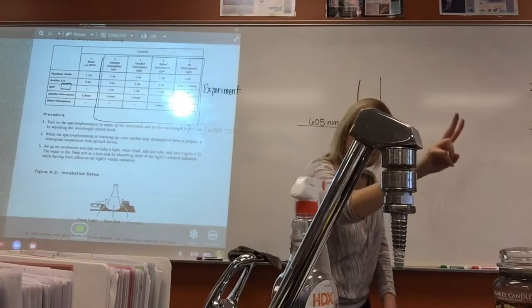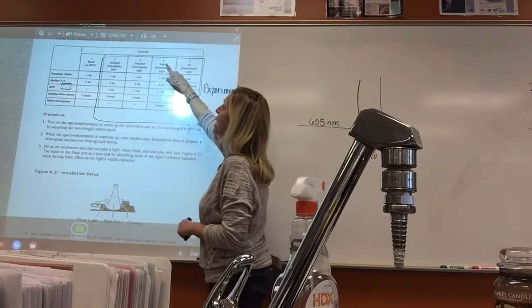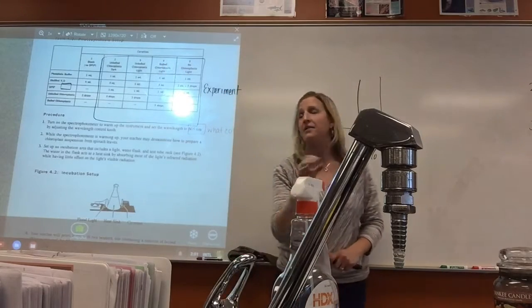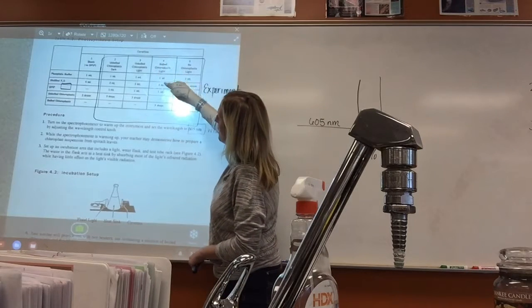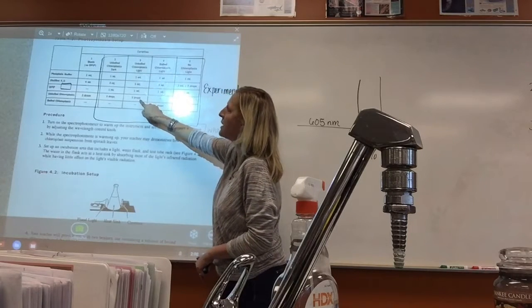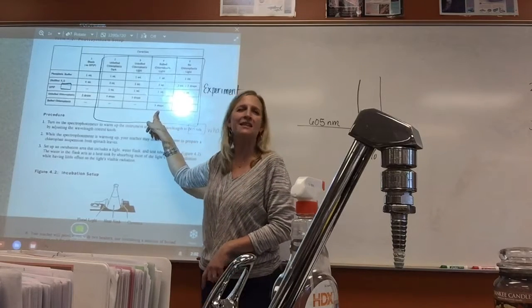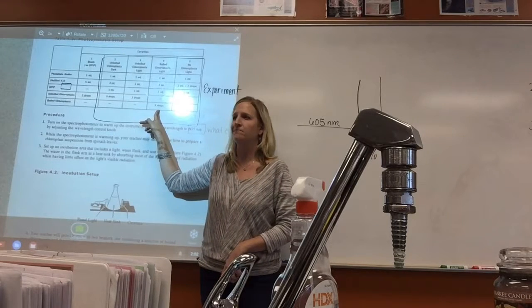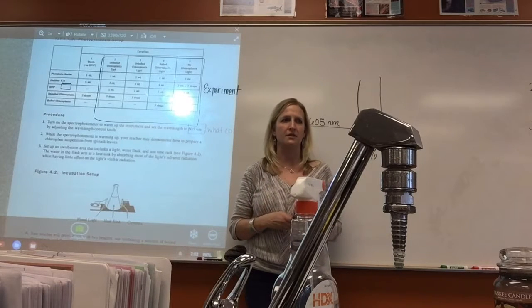But we're also testing a second hypothesis, and that is that chloroplasts are needed. So therefore, 4 and 5 are both testing the chloroplast hypothesis. Look at 4, it says boiled chloroplasts in the light. So everything's the same, they're getting the light, everything's the same as test tube 3, except the 3 drops are not unboiled, they're boiled. How does this play into testing whether or not chloroplasts are needed for photosynthesis?